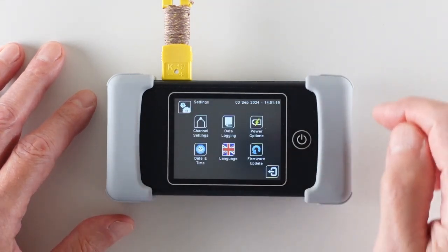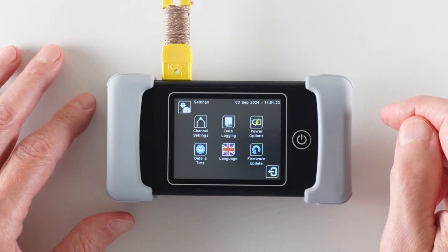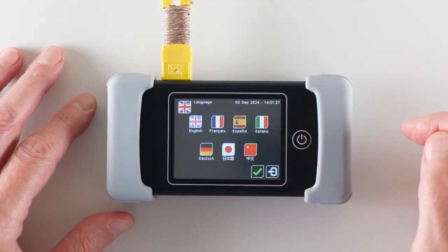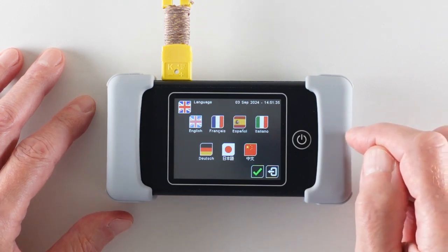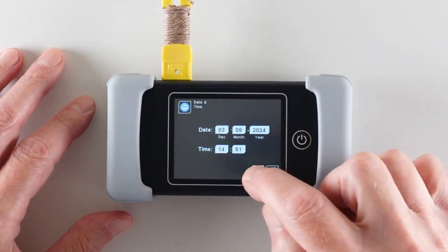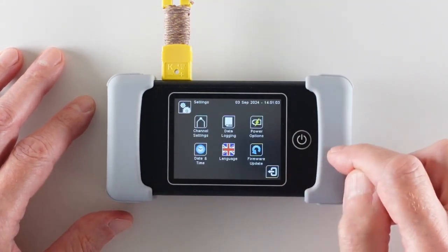Let's look at some of the options and set the Excelog up for data logging. In the language submenu, you can change the language on the interface with choices of English, French, Spanish, Italian, German, Japanese or Chinese. You can also set the date and time. Tap the green checkmark to save any settings that you change on these submenus, or the exit icon to leave the menu without saving.